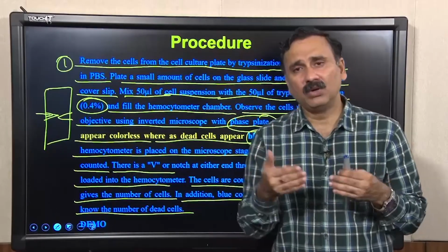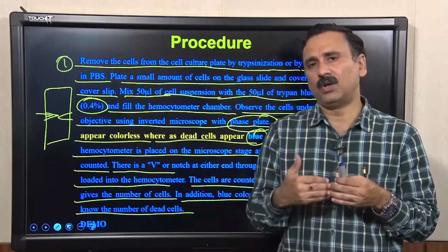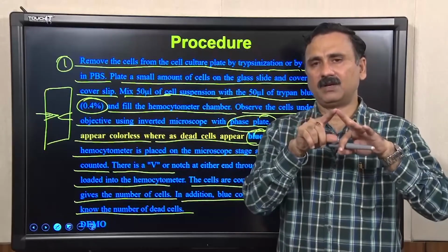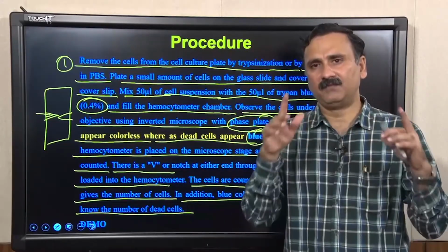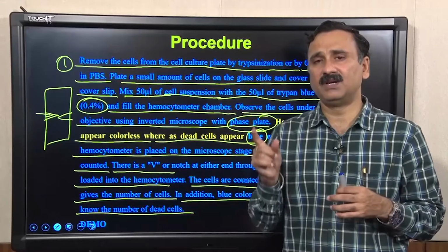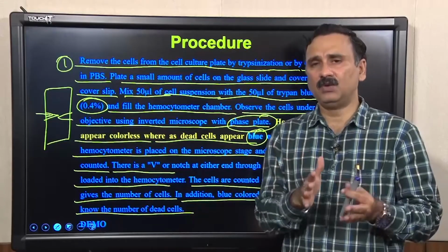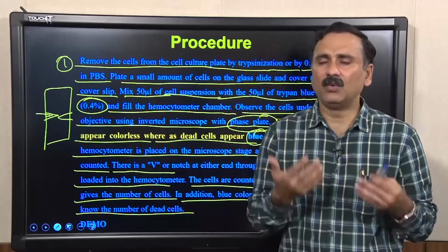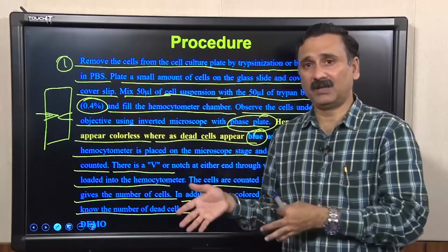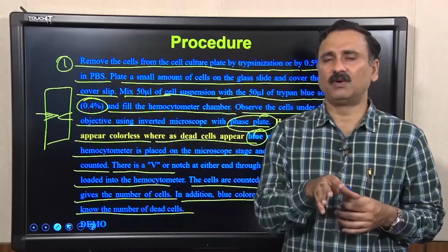So, this is all about the theoretical understanding of this process. Let me take you to my lab, and we are going to show you all these procedures. If you very clearly see the inside structure, the hemocytometer actually has different chambers, and you have to do a counting in these different chambers, so that you will be able to count the number of cells, and then ultimately calculate the concentration of the cells per microliter or number of cells per ml as well, because that information is required if you want to plate a specific number of cells for an experiment.